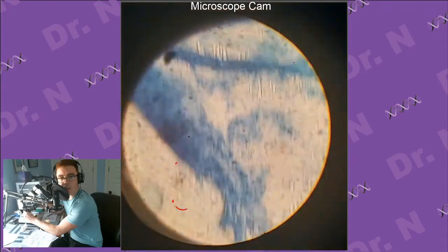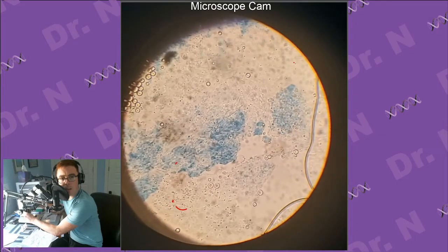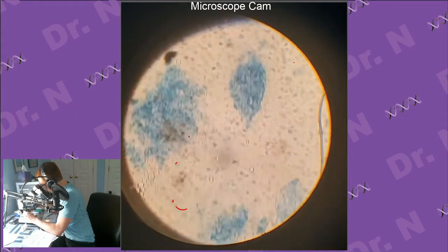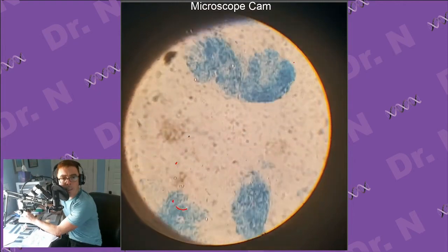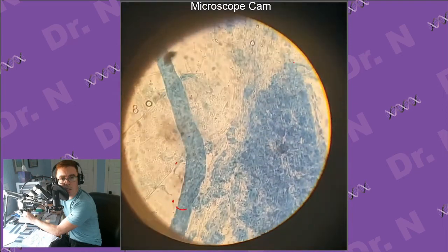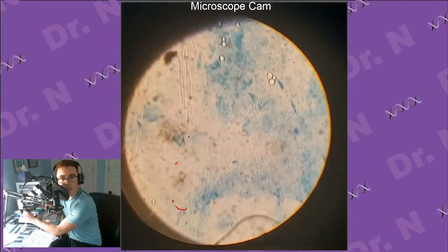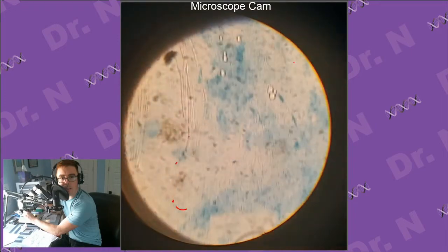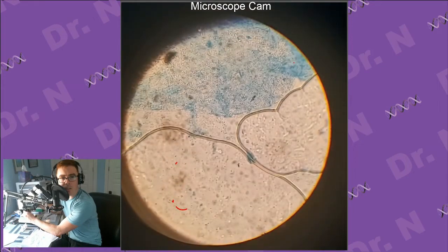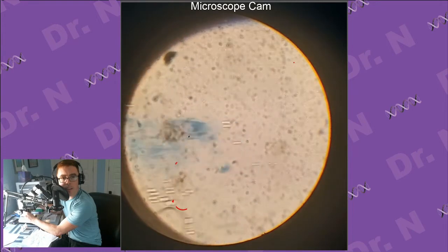This might take some off-stream practice. I might also just need to prepare some cells ahead of time. Oh, actually, so this really dark blue, I think these are actually about what we were looking for, but they're just not dispersed enough. They're not spread out enough to actually see anything too useful, unfortunately. Shoot. Well, I can try again. It's just going to take a little bit.